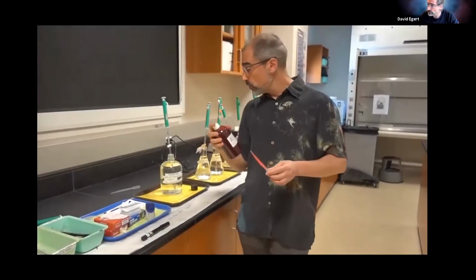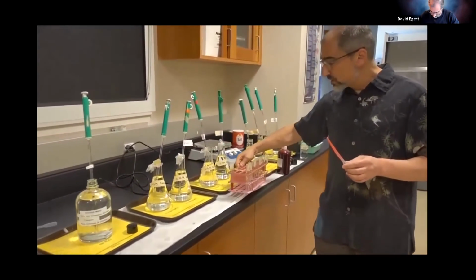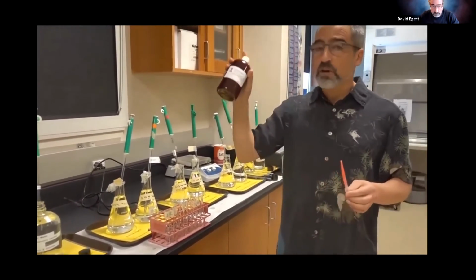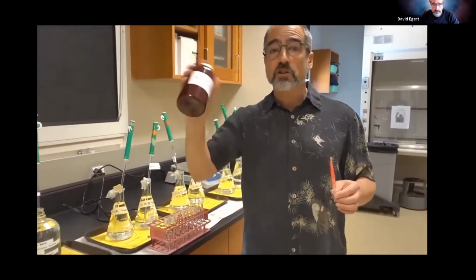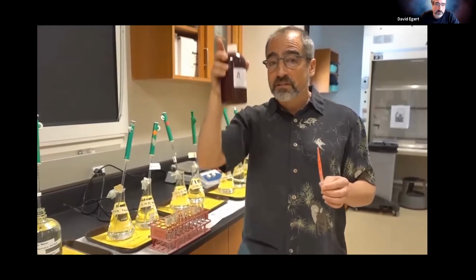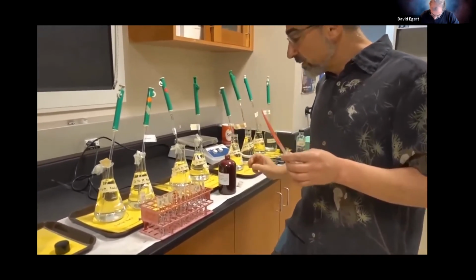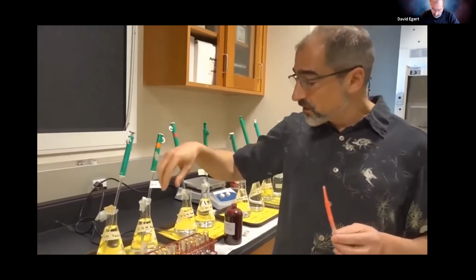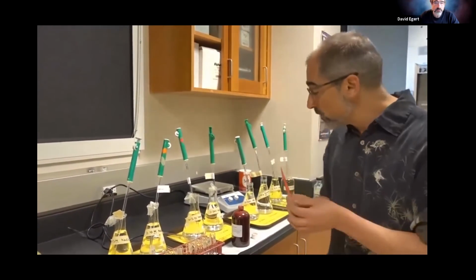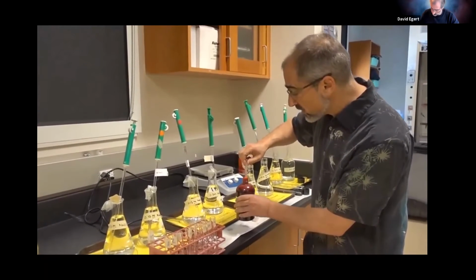All right, so we have each of the test tubes with the appropriate solution. And now each test tube is going to get 6 drops of the blood. Like I said, make sure it is well mixed, because the suspension, you're going to have the cells falling out. And again, because we want to only vary the solutions, we want to make sure the amount of blood in each test tube is the same.